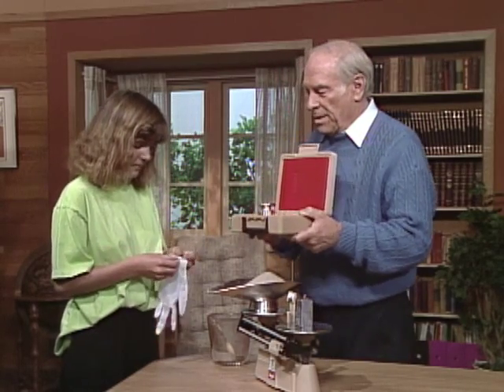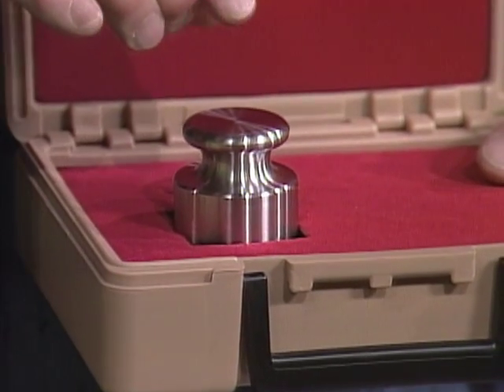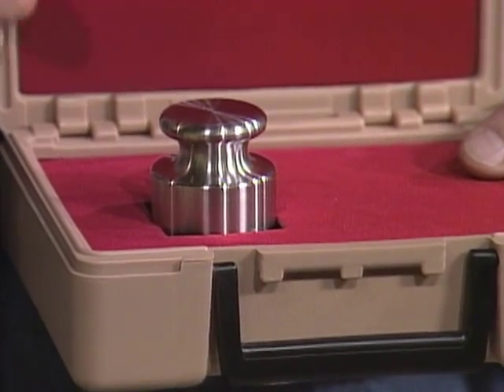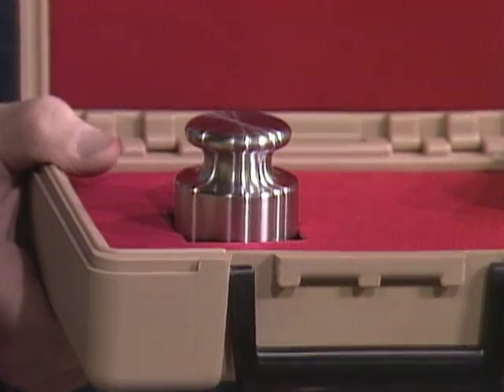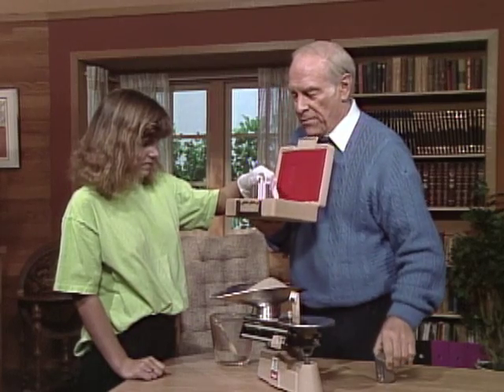See that glove? Take the glove and put it on, because when you touch this weight we want to make sure you don't get any of your body fluids and oils on it — because that would change the weight. That's how precise this is.